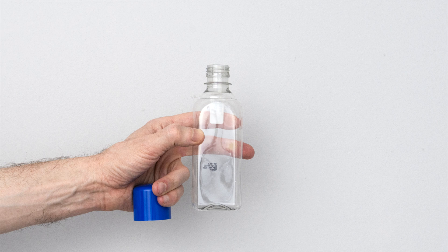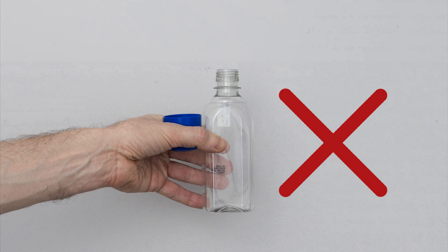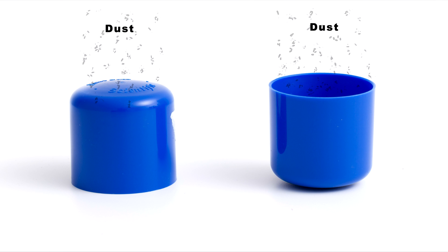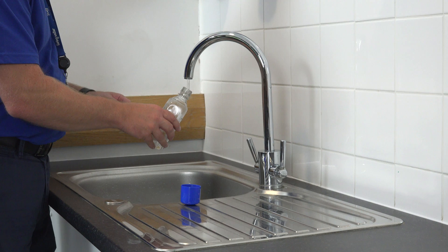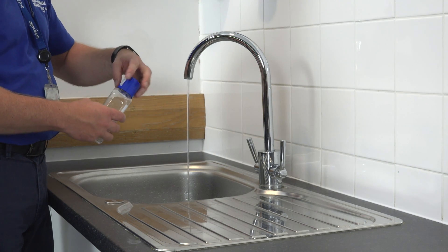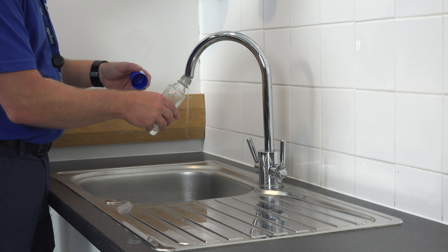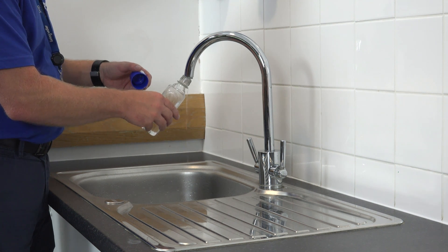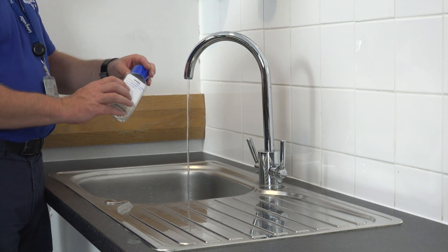There are several technique errors that you should guard against. Always hold the bottle cap with its opening facing downwards, never upwards. This minimises the risk of dust particles and other contaminants settling into the inside of the cap. Nor should you set the cap aside on the worktop, because this is highly likely to contaminate the sample. You should also take care to avoid the inside of the cap becoming contaminated by splashes or accidental handling, and ensure that no contact is made between the tap and the neck of the sampling bottle. If you make any of these errors, you should discard the sample and resample into a clean bottle.